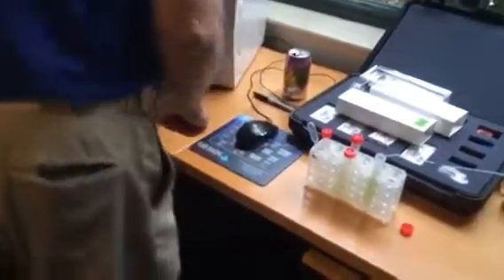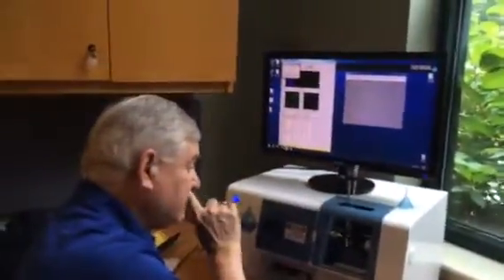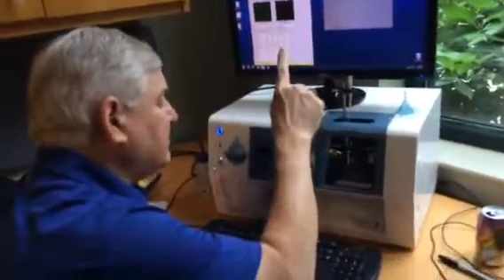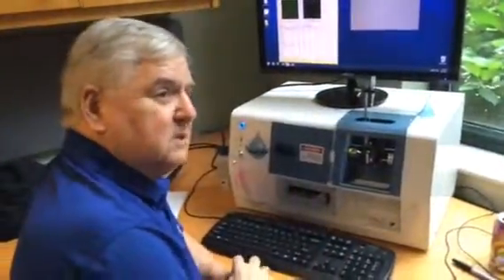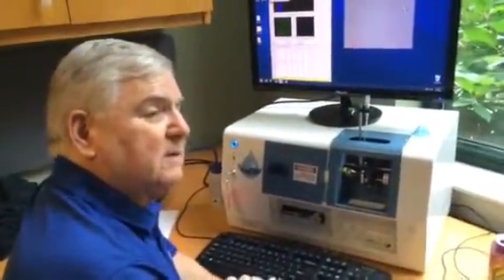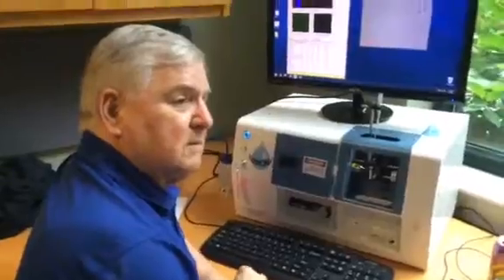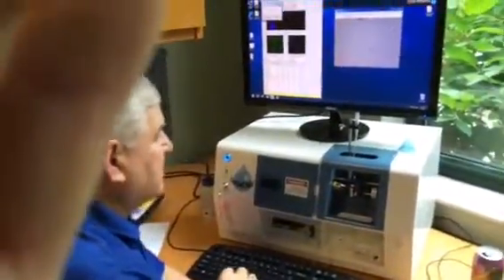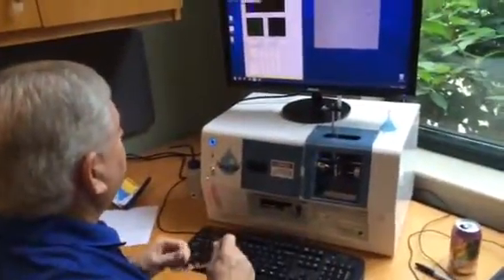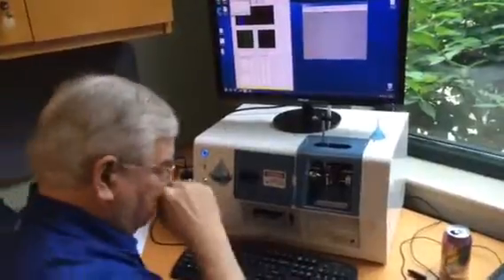Okay, then back. So that's ready to actually test. Now, this has already gone through the entire solution when it ran its autofocus. So we don't have to worry about prepping now. That was what I was concerned about before, getting it ready. But let's just go ahead and run it as is, and let's see how many focus beads are in there, just for curiosity's sake. That way you can get a good sense of what it looks like when it's not right.